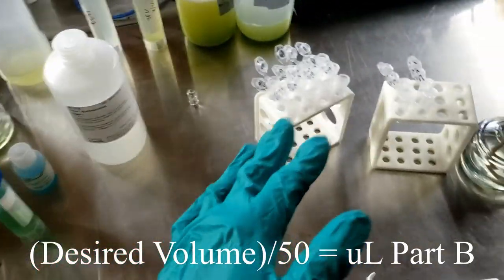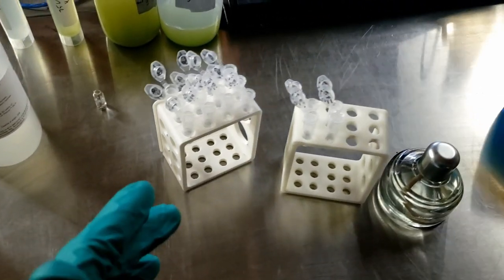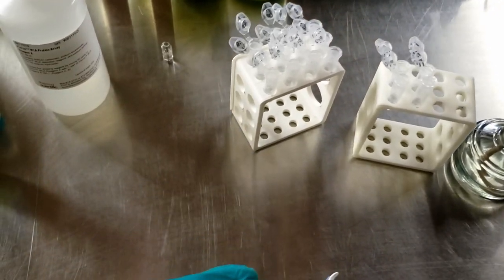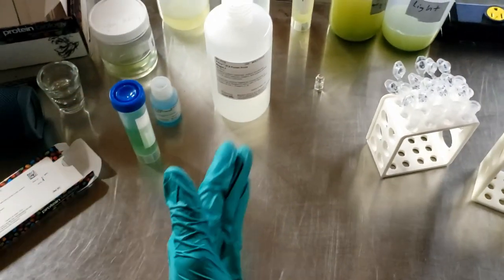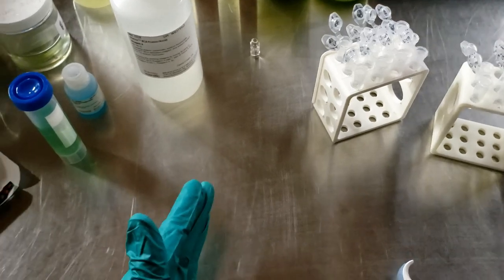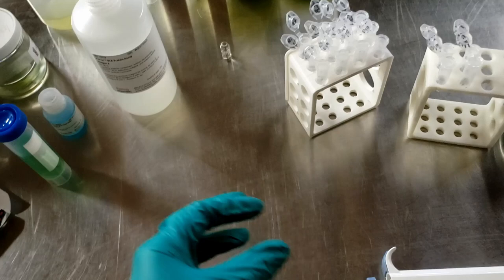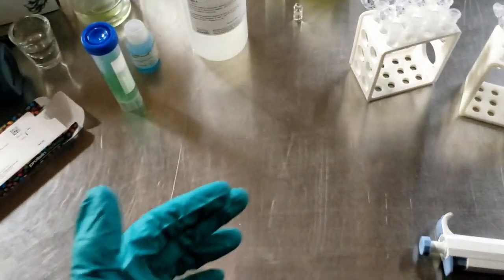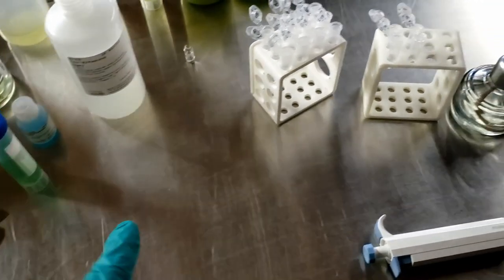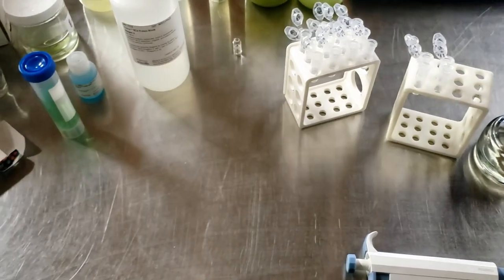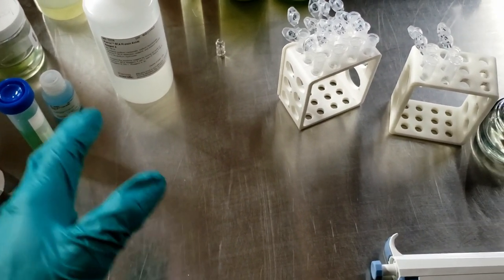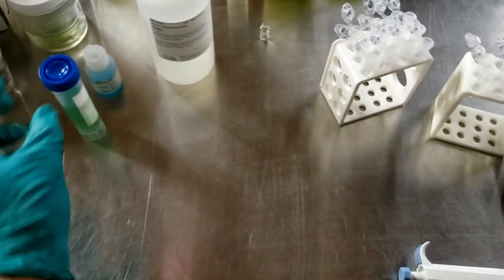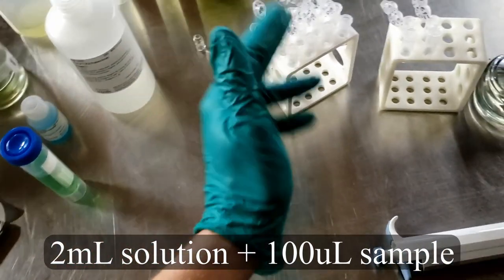Once you start the reaction, you have a couple of options. You can either incubate each of the reactions at 37 degrees Celsius for 30 minutes, or you can incubate them at room temperature for 2 hours. This doesn't have to be perfectly exact, but at those time points, those are the suggested times to measure it. If you let it go a little bit longer, the color change could be a little bit different than what the manufacturer expects. If you're using a spectrophotometer, you will set it to 562 nanometers. If you're just trying to get an estimate, doing it by eye is plenty good. I'll come back once I've put 2 milliliters of this reaction into each of my sample tubes.